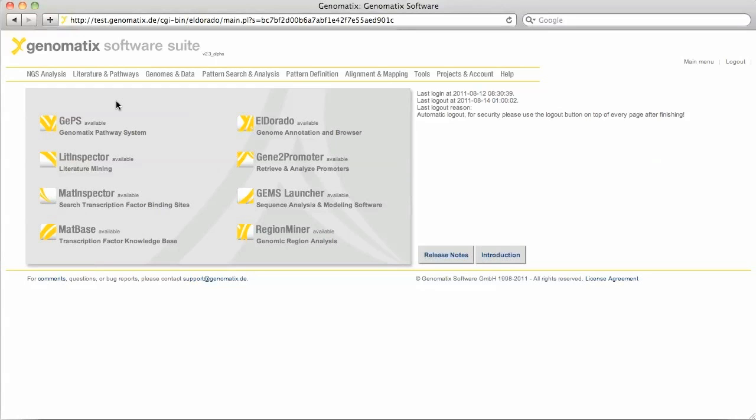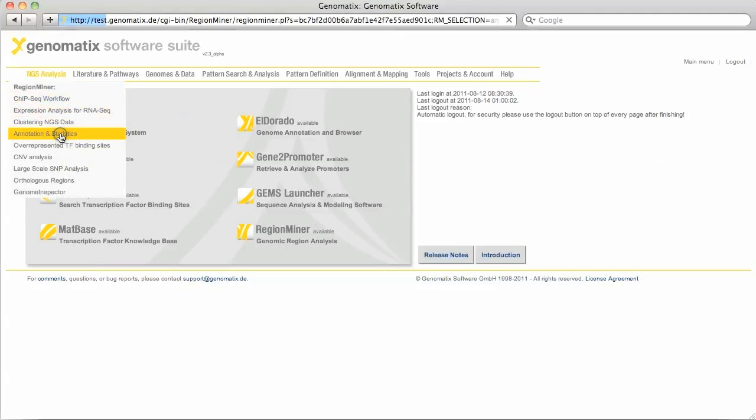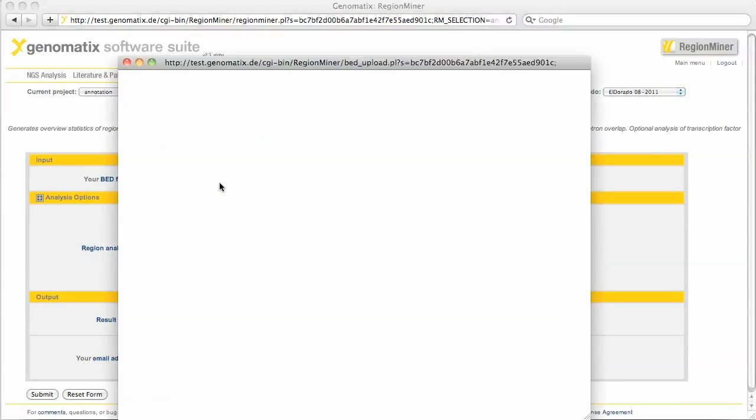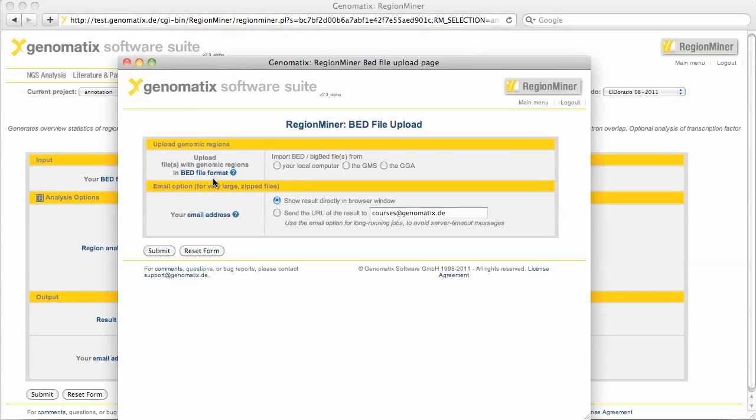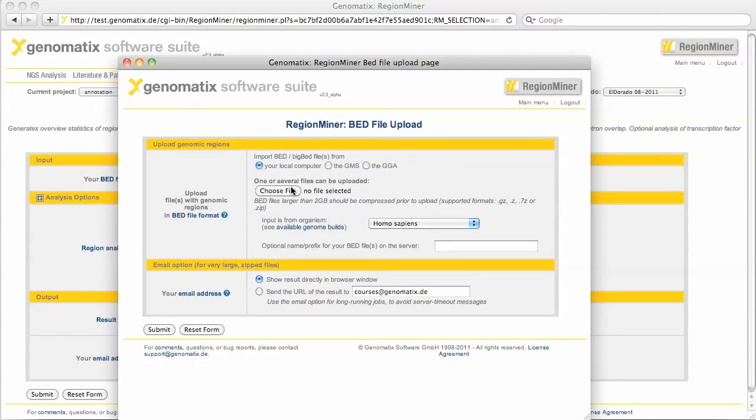The program annotation and statistics in the NGS analysis menu will give us a list of the neighboring gene loci for each genomic region in an uploaded file. As input we will use a BED file with genomic regions that simultaneously bind PPAR gamma and retinoid X receptor in developing mouse adipocytes.